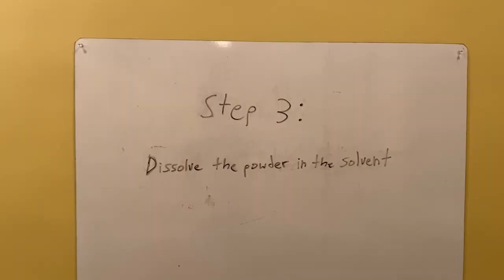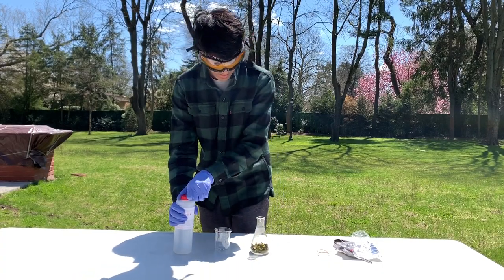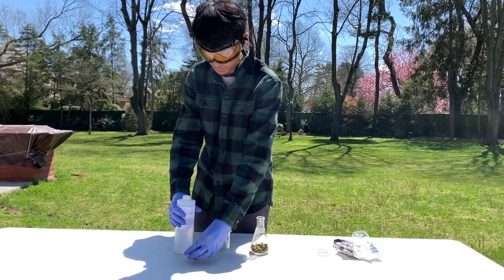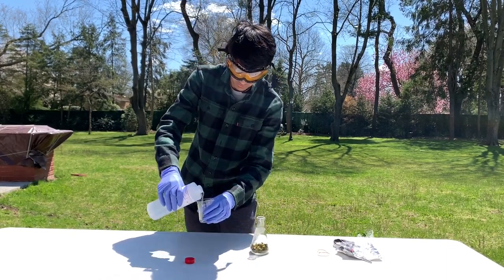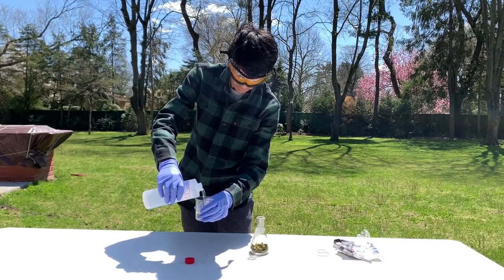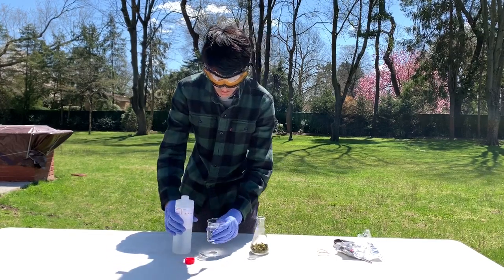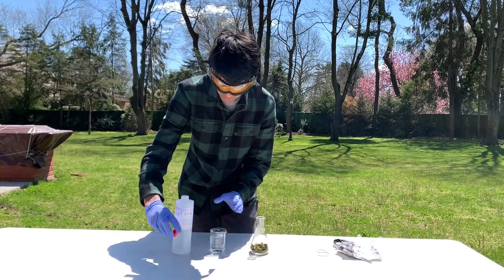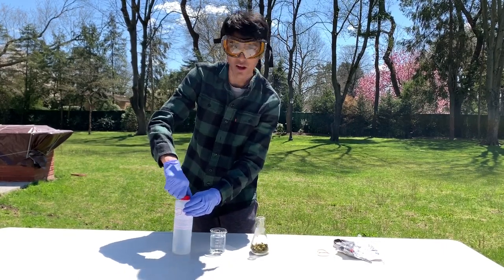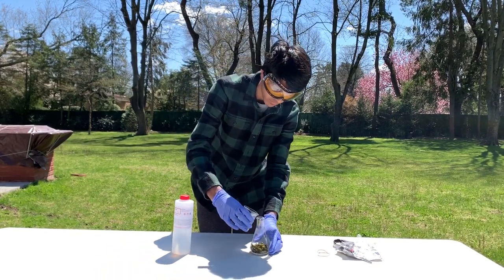Step three is to dissolve the powder in the solvent. Now we're going to transfer 100 milliliters of the methanol to the peppers. This is to let the capsaicin dissolve into the solution. Since we have around 12.305 grams of ground-up peppers, we're going to be using 100 milliliters of methanol.